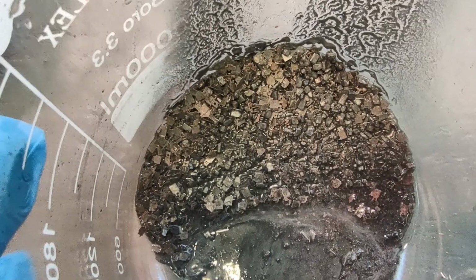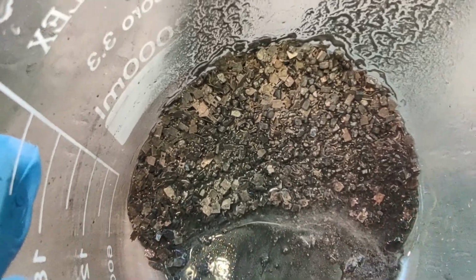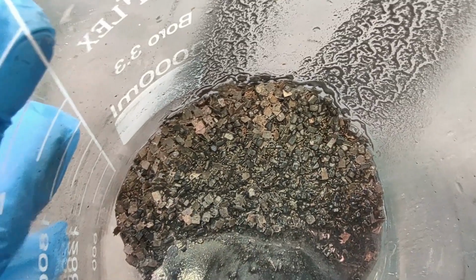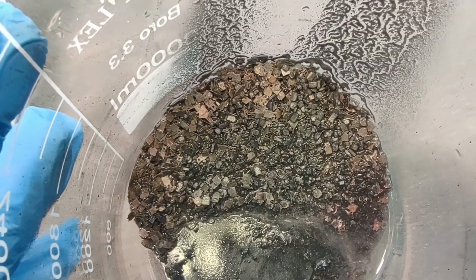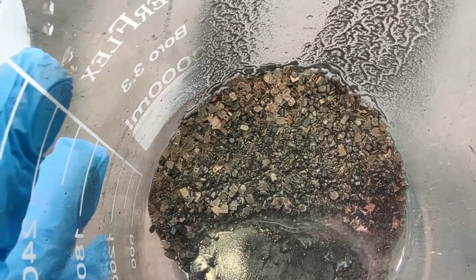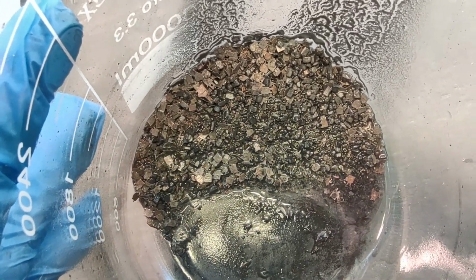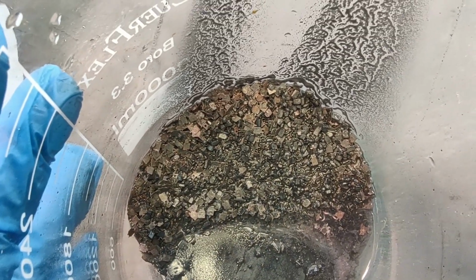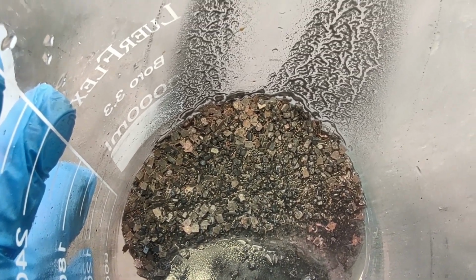I thought I'd give you a look at just how coppery this stuff looks before I get it in the fume hood and start treating it with acid. It's definitely a whole lot more coppery looking than it was. I think we have dissolved away the vast bulk of the steel out of here. I can't pick the stuff up with a magnet anymore either. I'm not foolish enough to believe we got all the iron out of it, but I think we've got the vast bulk of the iron out of it, which is great.